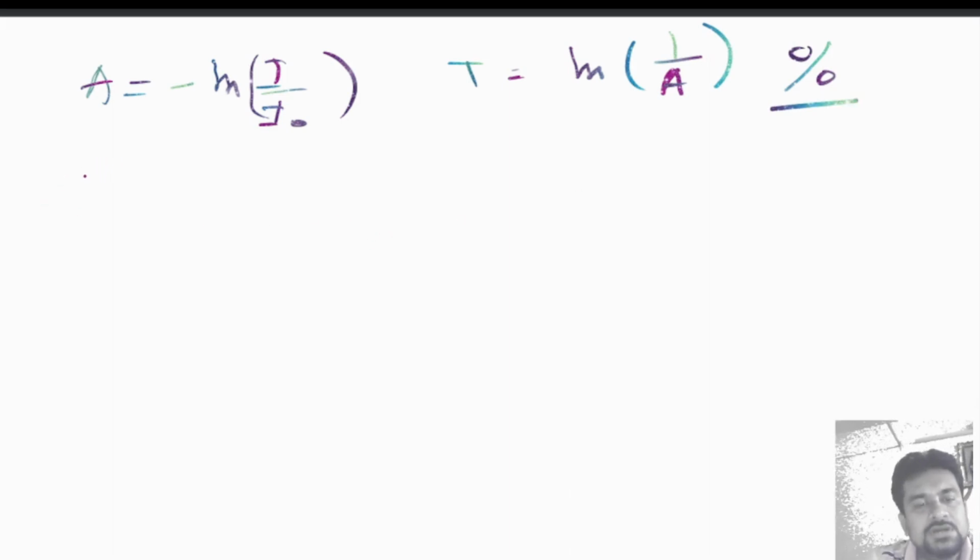So if you measure your absorption using your absorption spectrometer, you will get data within a certain range of absorption. That means your absorption spectrometer has a certain limit, and over that limit it gets saturated. So you will get from 0 up to a certain limit, say P. P is the highest limit of absorption in your spectrometer.